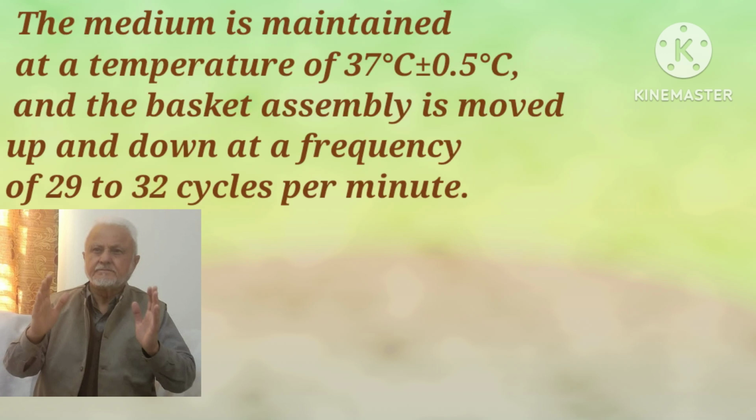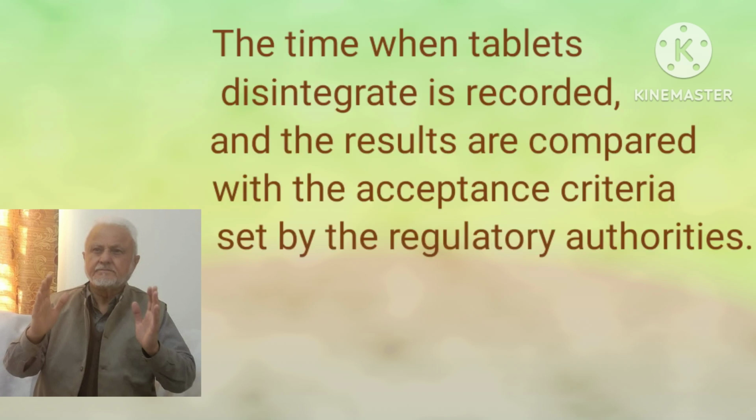The medium is maintained at a temperature of 37 degrees plus or minus 0.5 degrees centigrade, and the basket assembly is moved up and down at a frequency of 29 to 32 cycles per minute. The time when tablets disintegrate is recorded and the results are compared with the acceptance criteria set by the regulatory authorities.